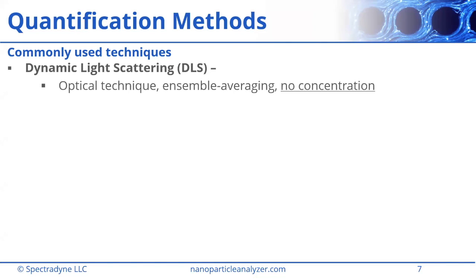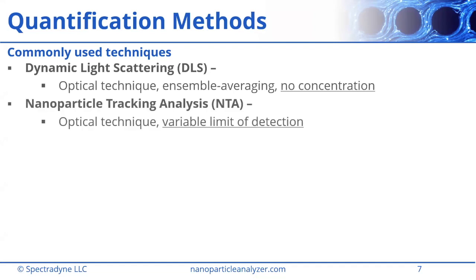In addition, as he mentioned, dynamic light scattering does not give any information about the concentration of the particles. So we're not getting dose from this technology, but it's very commonly used, so we'll talk about it in more detail in a minute.